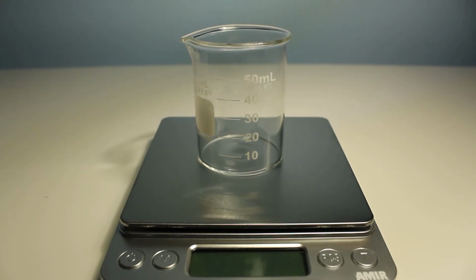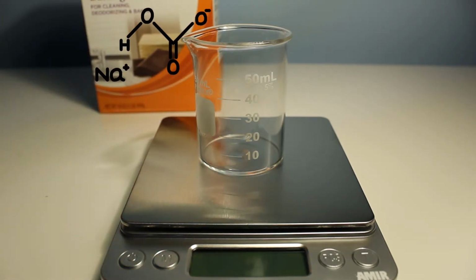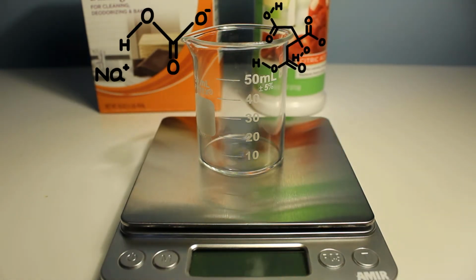The first step to making this solution is to make sodium citrate. Sodium citrate isn't sold very widely, and so making it is the best decision, since its ingredients are widely sold at many grocery stores. The first ingredient we'll need for this reaction is pure baking soda, commonly found in most grocery stores. The second ingredient is a little bit more scarce, citric acid. It can be found at some grocery stores, but you'll have a hard time looking for it.